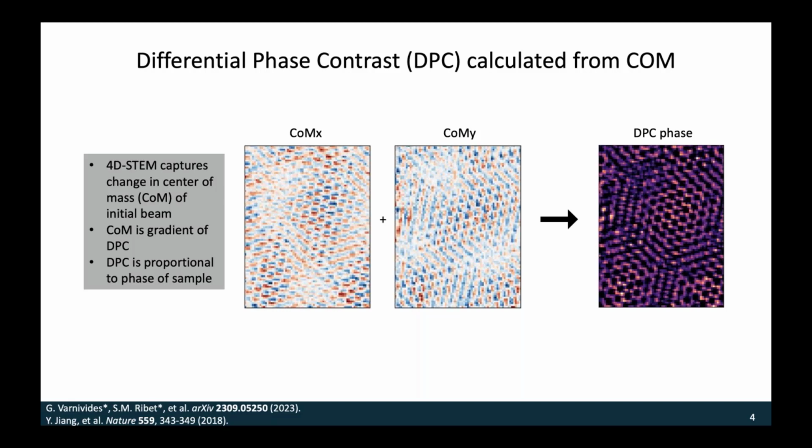And DPC is really good. This was fast. This was pretty easy. We just had to do very little calibration, and we get this nice reconstruction. You'll see in a minute the challenge with DPC, though, is whatever aberrations we have in our probe, in which you may have defocus. We'll see why you might want to add defocus in your probe, and that's going to be transferred to your sample. So DPC isn't as good in this case.